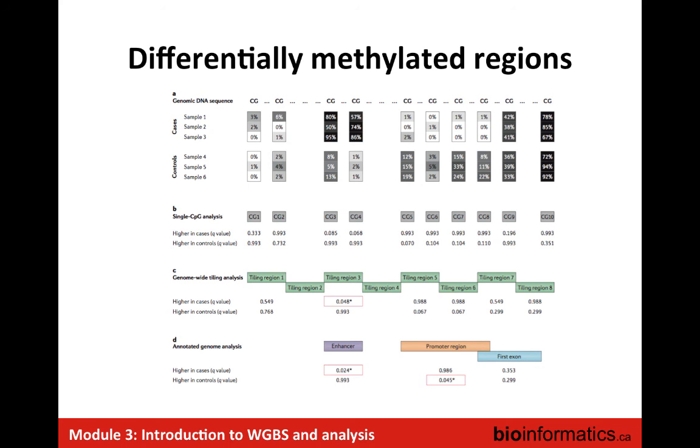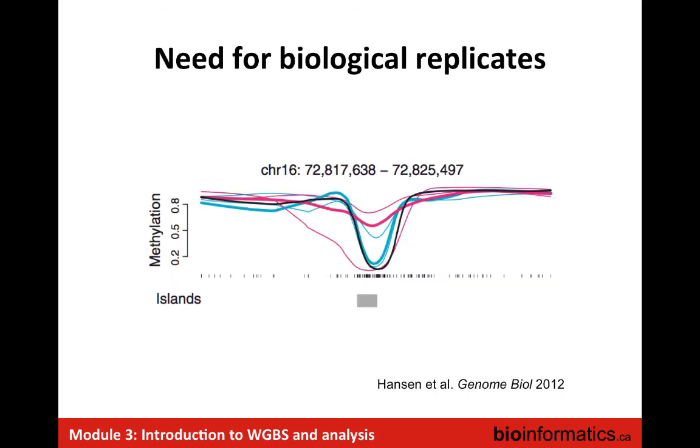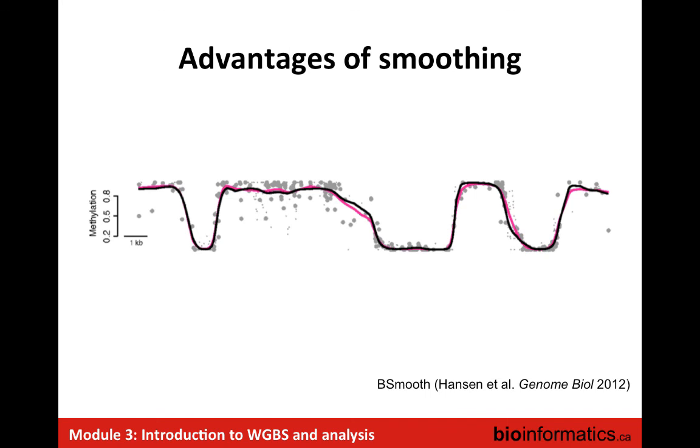What sort of tools do you use to do the differential methylation analysis? Are there any specific to this context, or any software? Yeah, so I have one here, BSmooth, and there's a number of tools. I think I had that in the initial slides as well, in terms of different tools that can do this differential methylation.